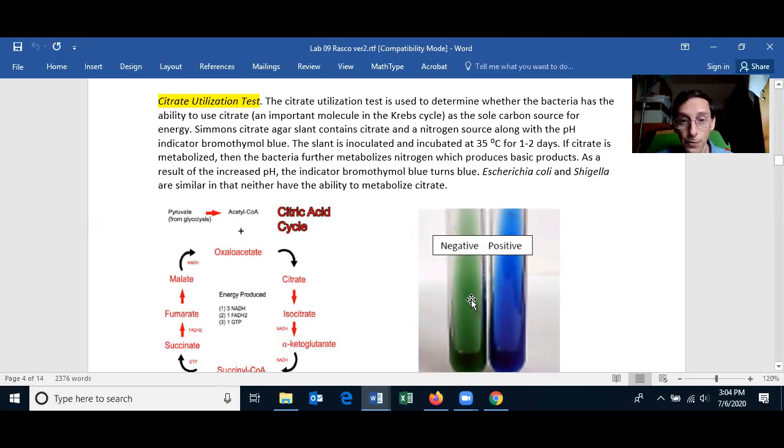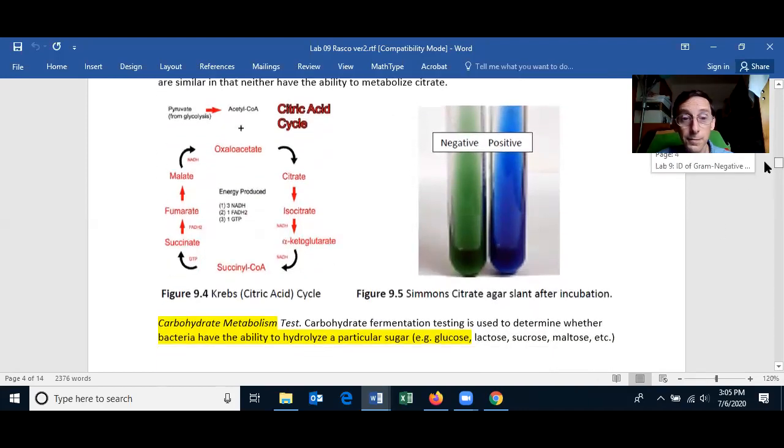And an easy way to do it would be to take this tube, and if there's growth on it, streak the growth on this tube to another tube, and usually the second time you won't put on too much bacteria, and if it doesn't grow, then you know that you added too much bacteria to the first tube. Okay, any question about that?